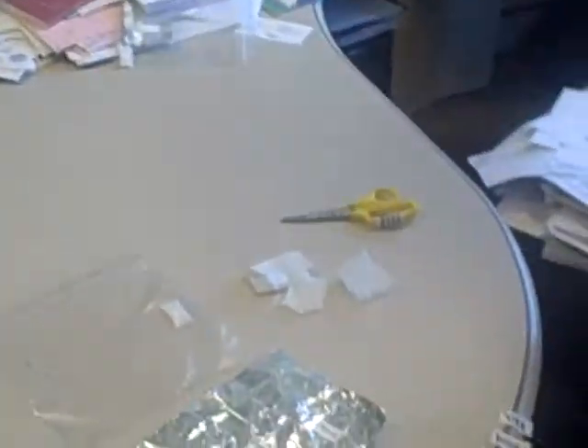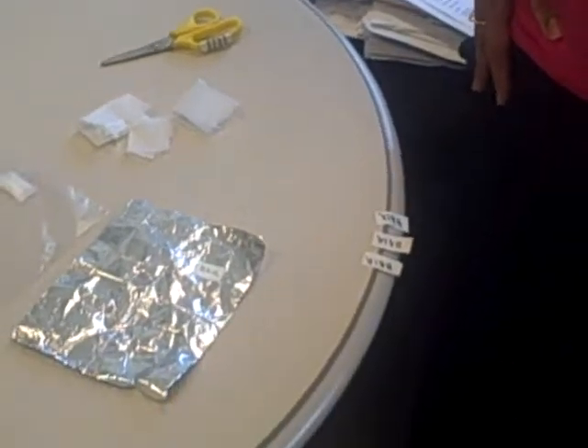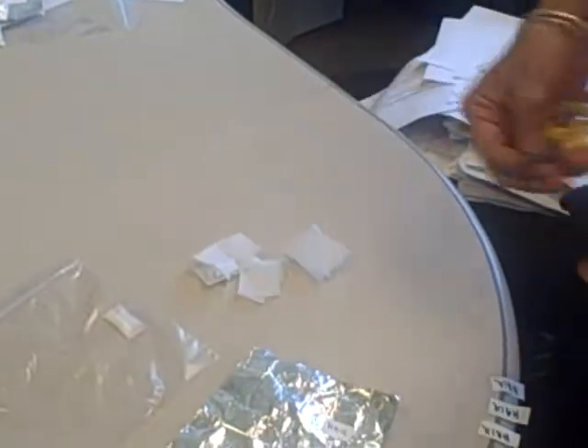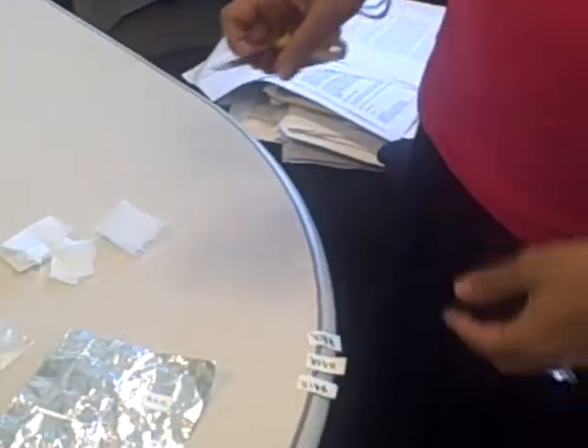This is to demonstrate the collection of hair for our hair collection studies. This will be demonstrating the collection of 20 pieces of hair for protease inhibitors and NNRTIs.